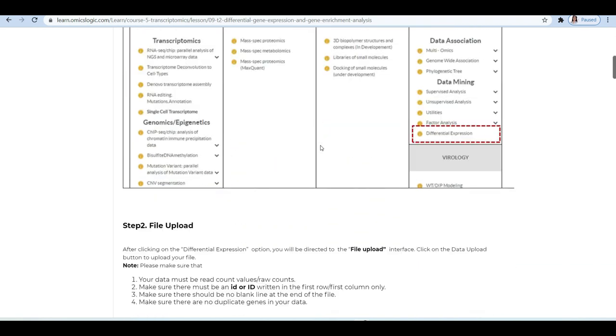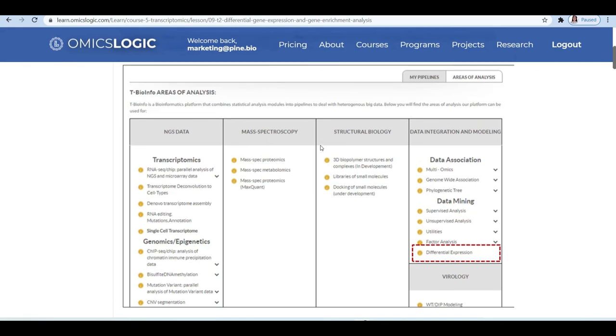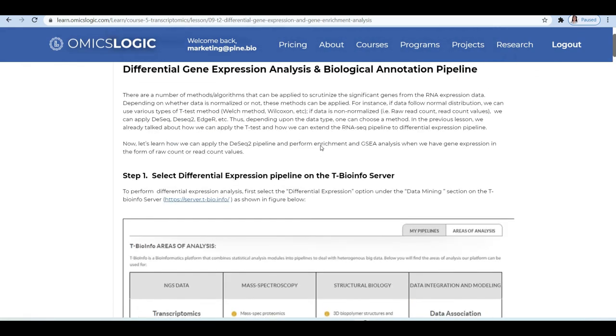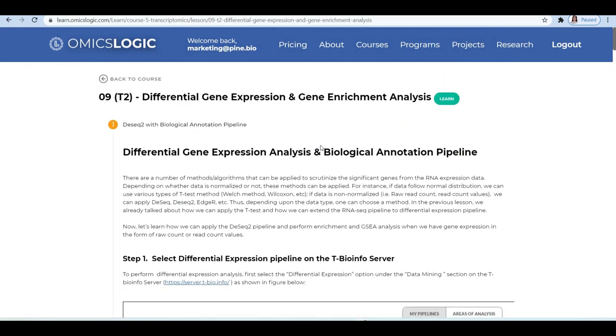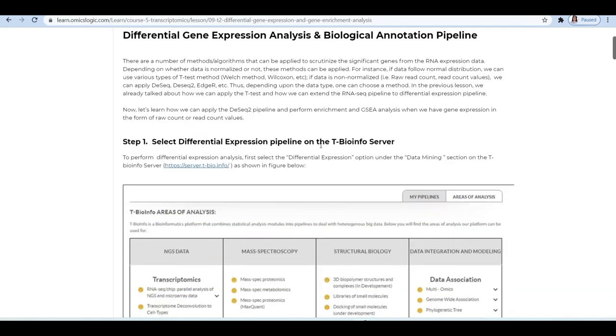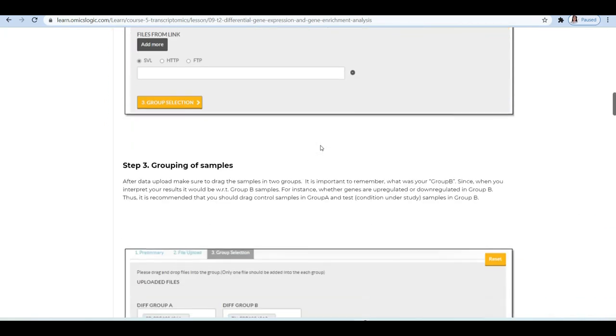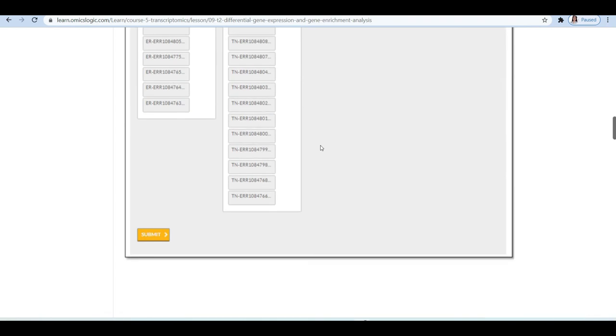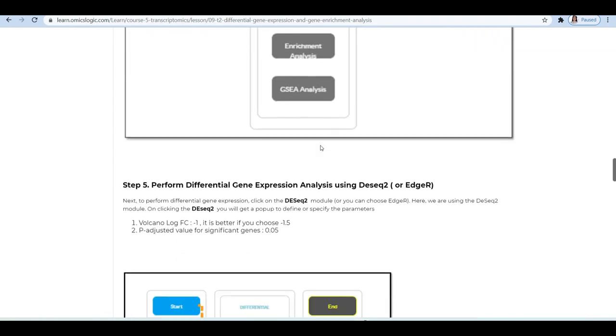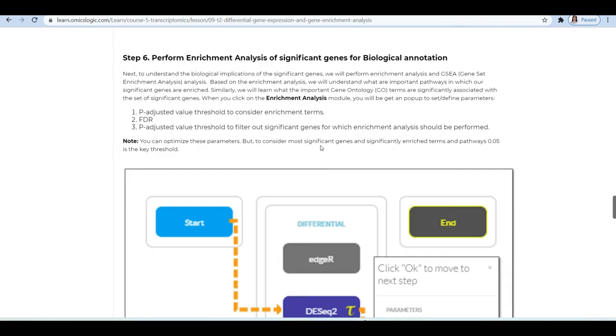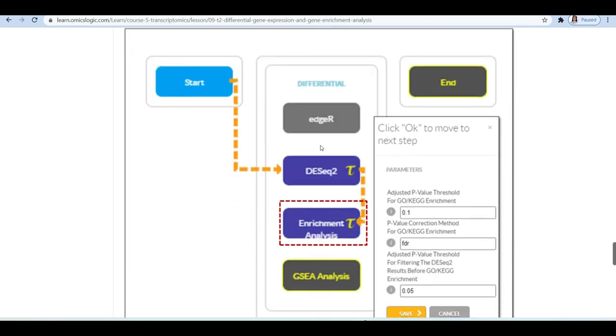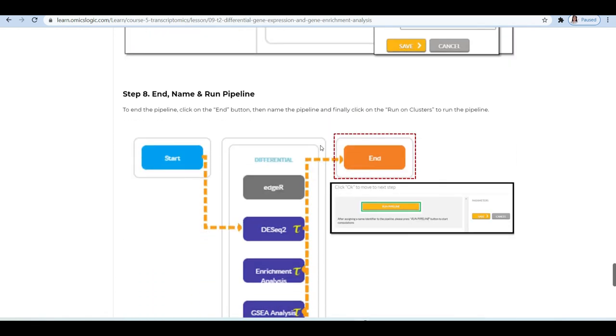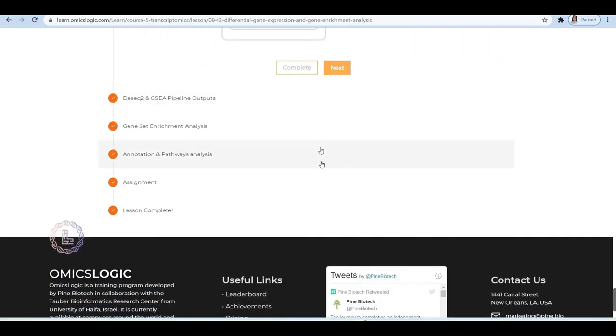Now to learn more about each and every instruction that we just followed to run the pipeline and also to analyze the results and interpret your biological insights, you can visit lesson number nine on learn.omics logic portal. In this lesson, you will learn how to derive biological meaning or annotation once you identify significant genes and you will also learn how to perform and interpret gene enrichment analysis on the server.